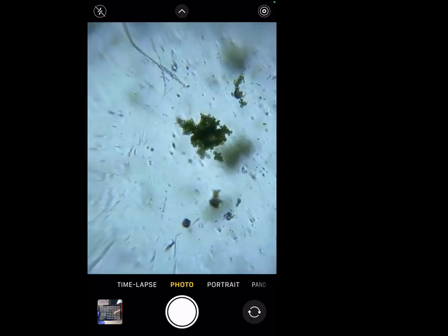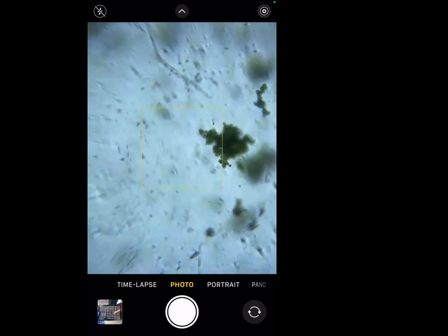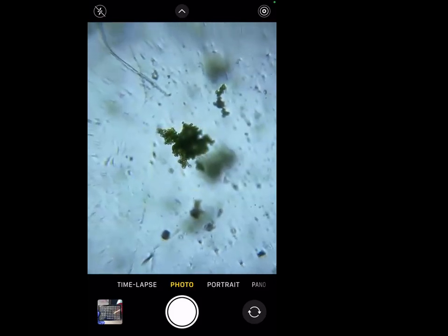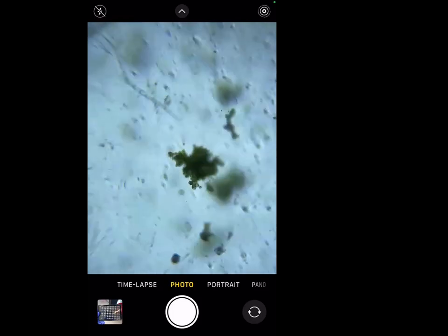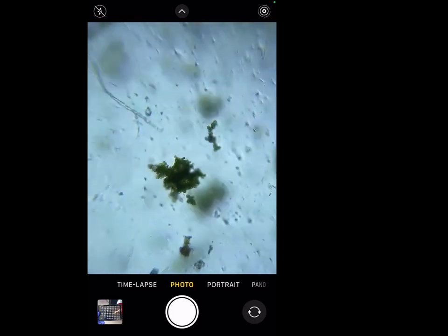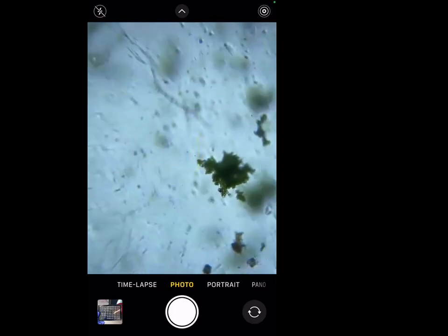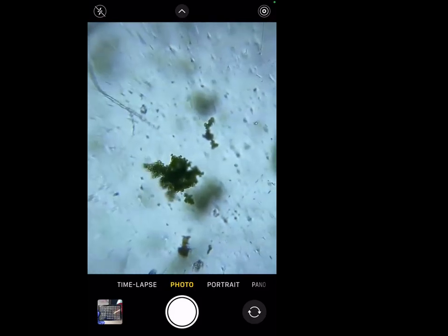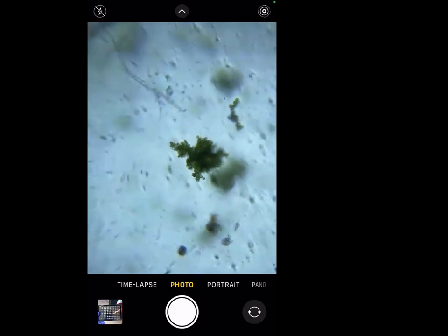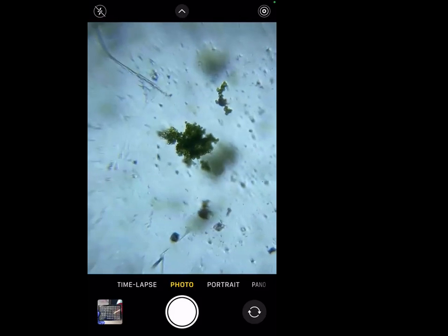Okay. Can you all see what it is right now? I see it circular and clumped. Yeah, so there are clumps of this algae. They're circular dots. They must have a nucleus or something. I don't know what kind of algae we have here, but we can take an image and analyze it later. I'm just trying to bring it to the center and again, trying to focus.